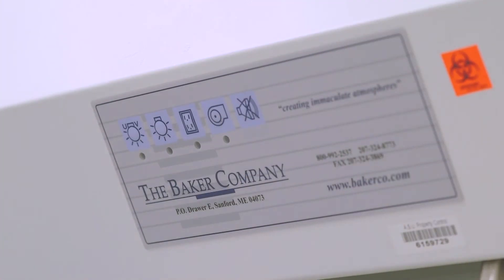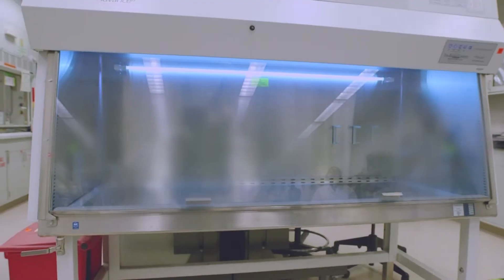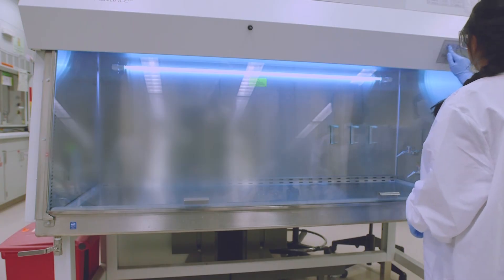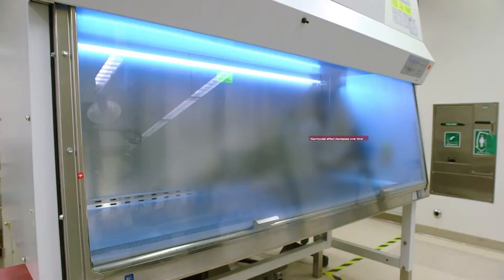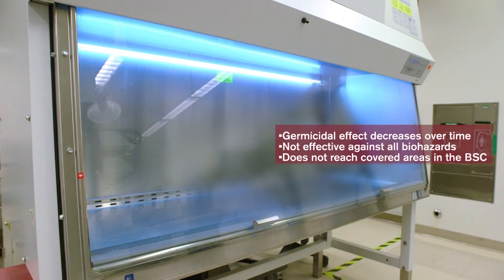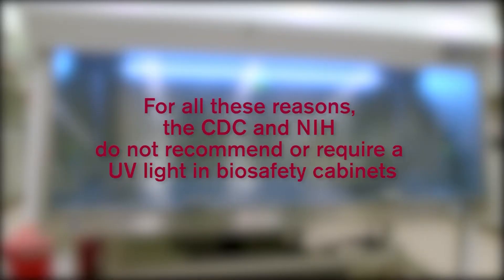A common feature in most biosafety cabinets is the ultraviolet or UV lamps. For years, UV light was considered a method to provide a clean and sterile environment inside the cabinet when not in use. However, there are several limitations: the lamp requires cleaning to remove dust and dirt; the germicidal effect decreases with use; UV light is not effective against all types of biohazards; and UV light will not reach any covered area. For all of these reasons, the Centers for Disease Control and Prevention and the National Institutes of Health do not recommend or require UV light in biosafety cabinets.